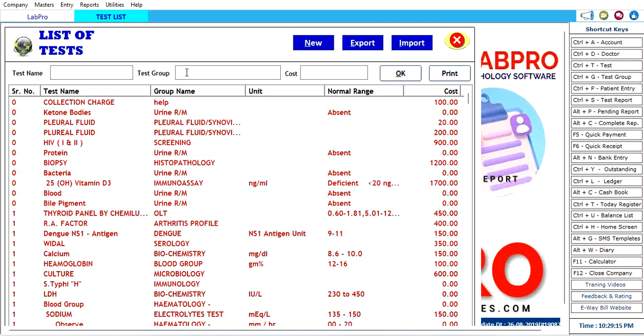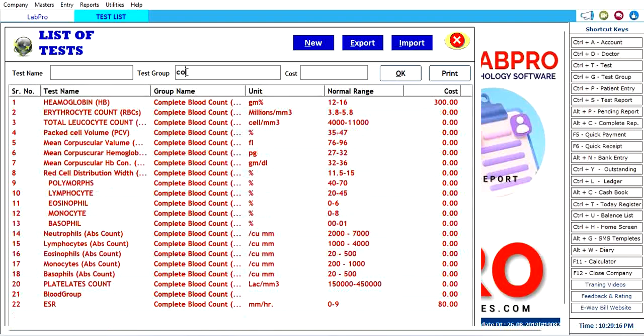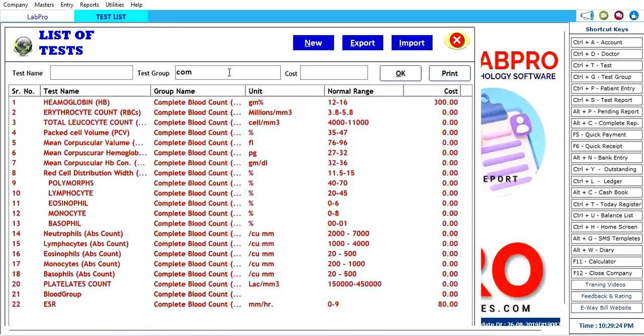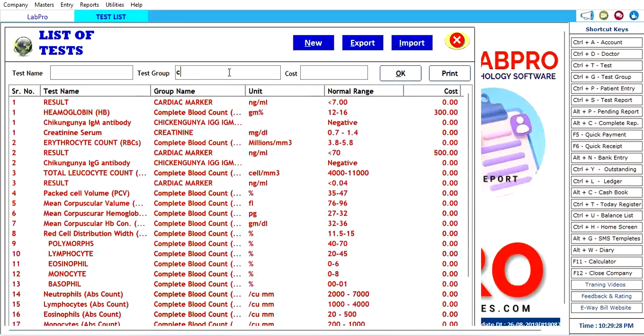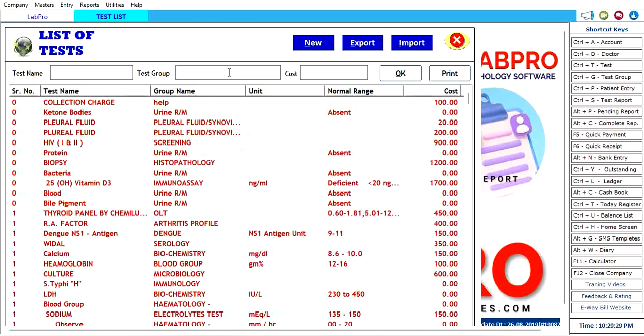So many tests here. If you want to test Complete Blood Count, you can see the list. All the latest software is available here and all the latest tests are available.